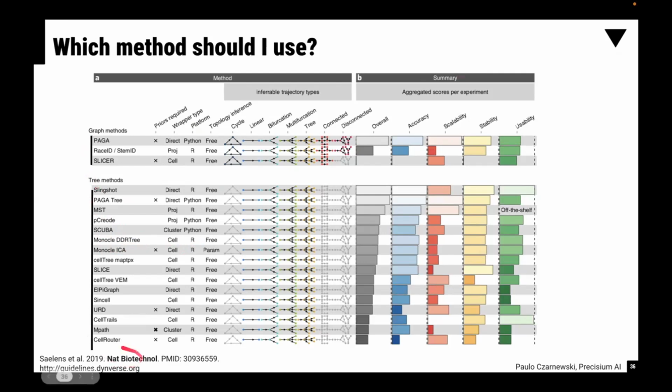So please check out this paper or also their interactive tool. It's actually still a copy of the paper, but interactive, if you want to check. Otherwise, as I do as well, I still follow all the instructions in this course when I want to do trajectory analysis, because they're just so useful.